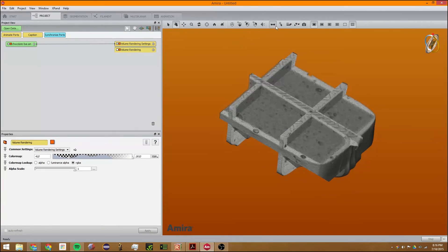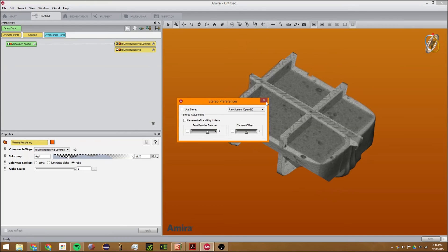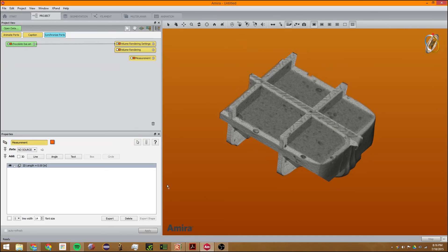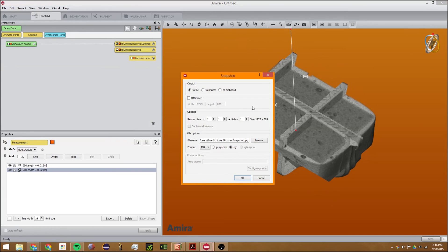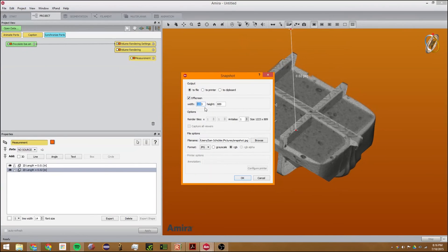If you want to use stereo 3D, you can. You can also use the 2D measurement tool. You can use this to take a snapshot and have it go to clipboard. You can change the resolution of the snapshot by typing in new values here.